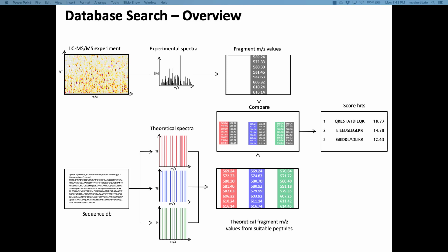And that is why people found intensities to be not that reliable. People have also tried to predict these intensities, and that is a very tricky business as well. So prediction of intensities can improve the scoring, but in most of the cases when people tried it, it did not work that well.